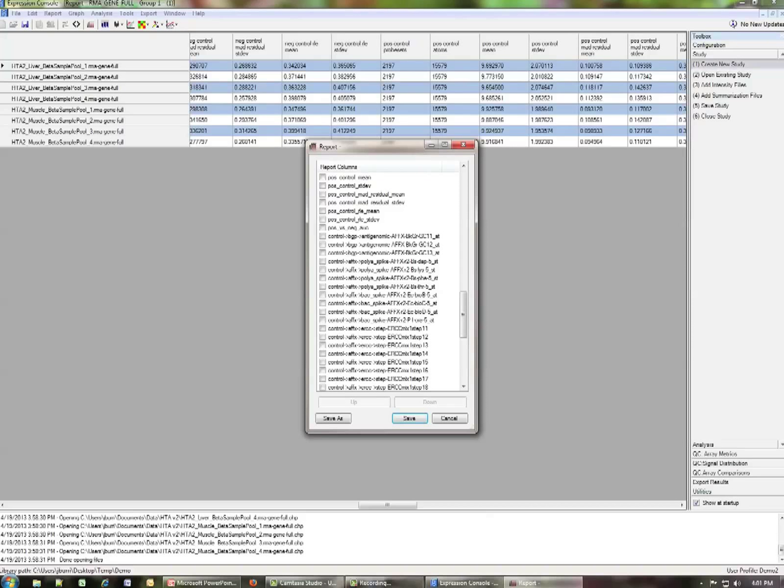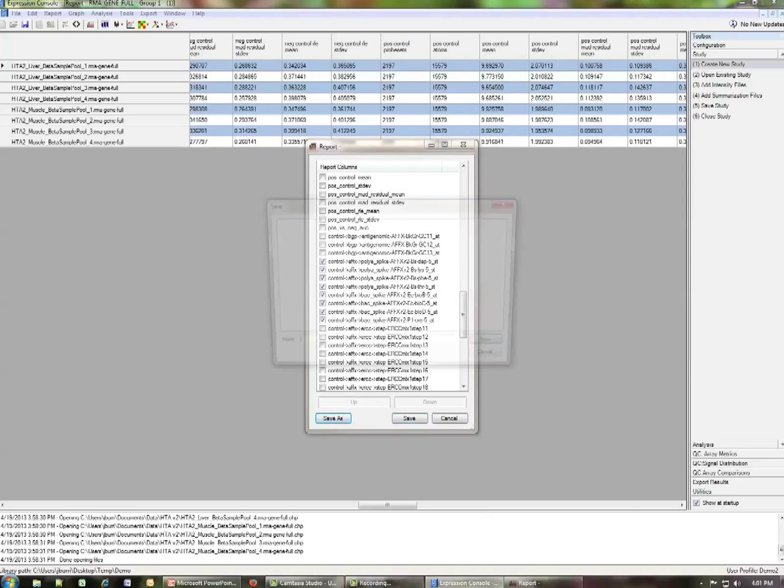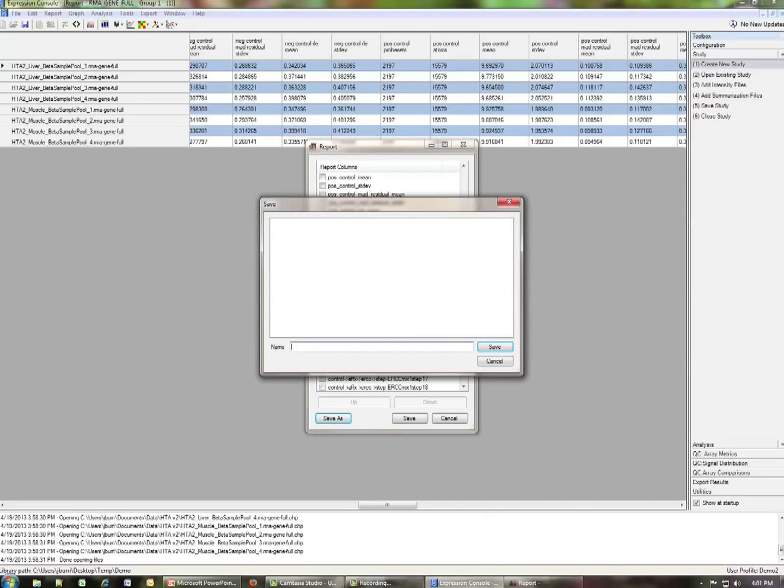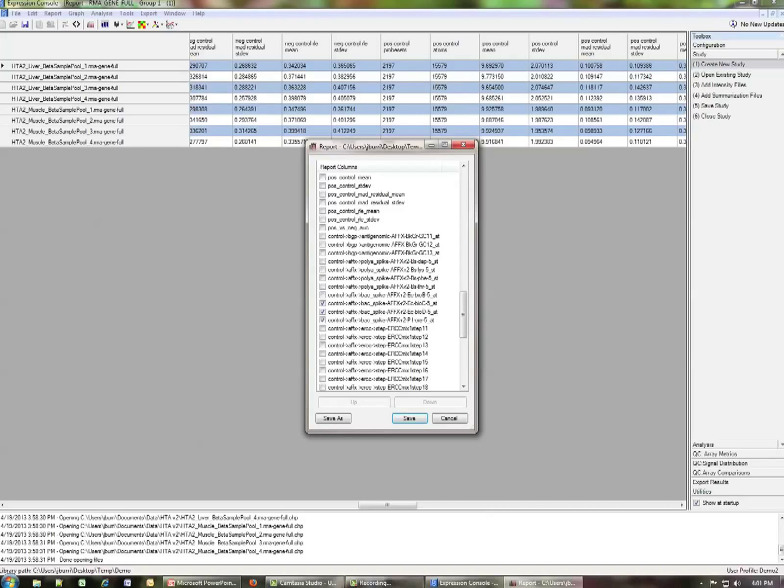So let's go ahead and just create a report that has just the hybridization and labeling controls from Affymetrix in it. So I'm going to check these and I'm going to click save as and we will set this as AFFX. Okay. It's also possible to go ahead now and uncheck these.